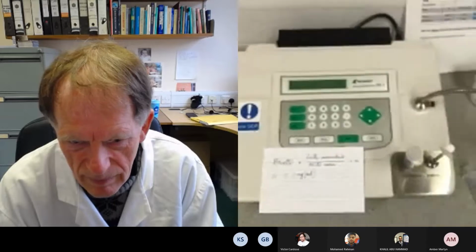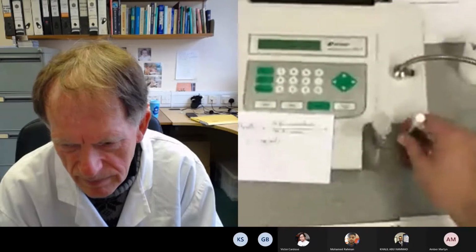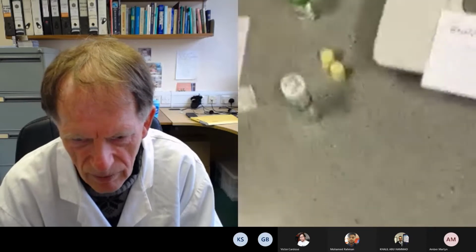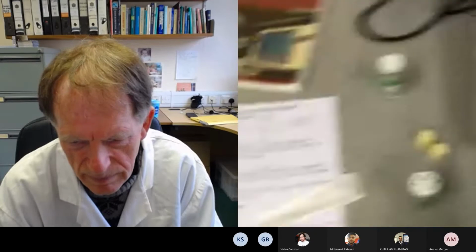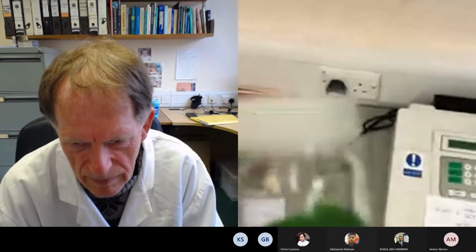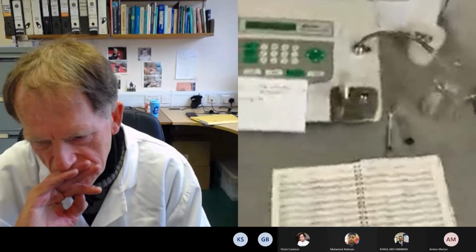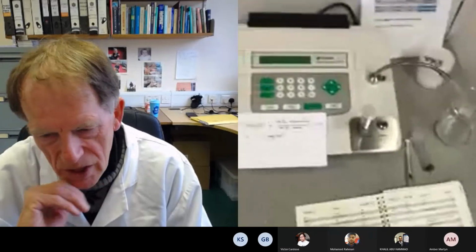Yeah, well, I think that's enough. That's it for me. You can clean it now, and that's it. Fine. So this solution was different from what Thomas looked at? I think it's the same solution, Thomas. Yeah, it's the same. It's the 1 in 11 dilution. Okay, that's fine. So it's the same, and it gives a slightly different concentration reading because of the other material in there.